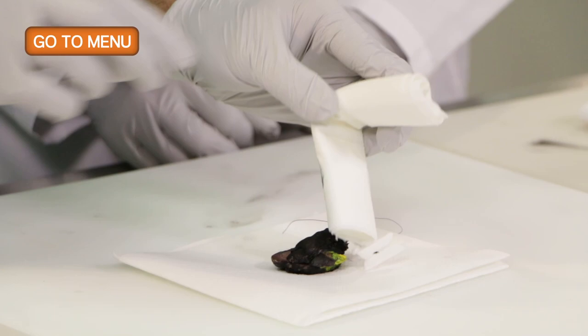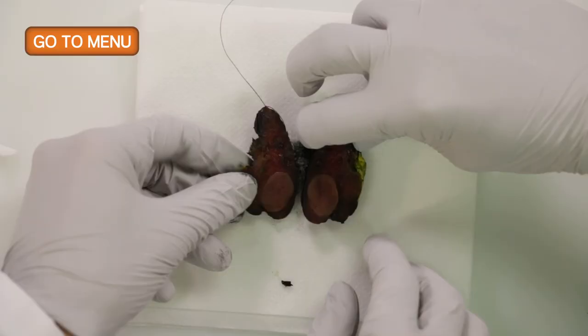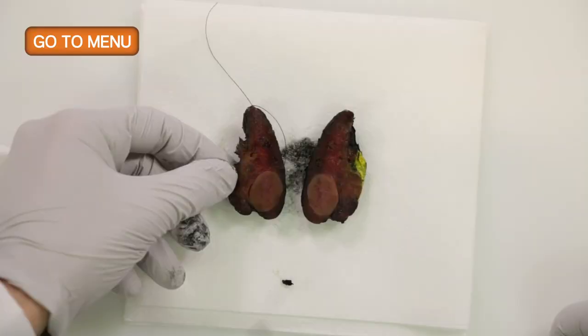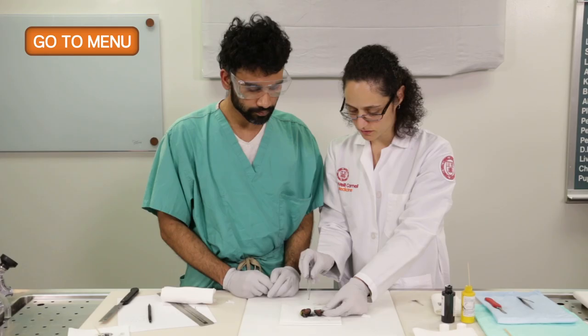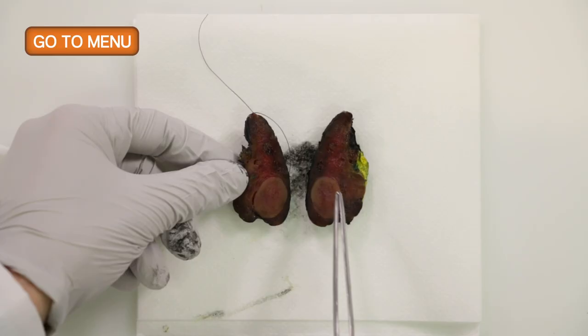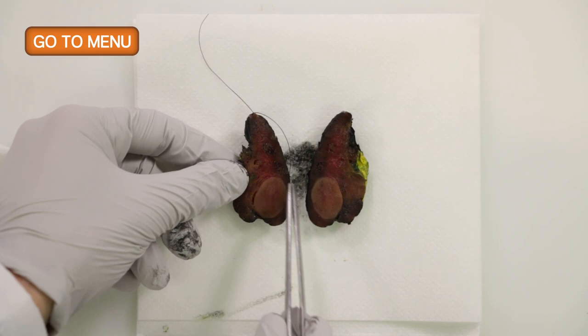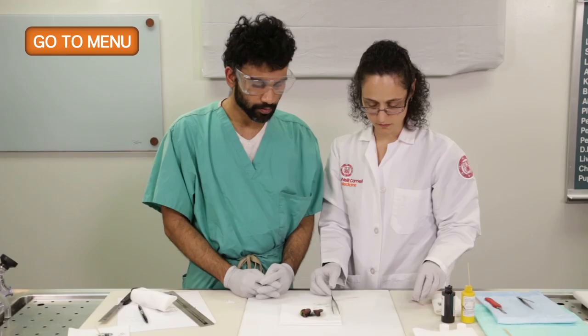So now that we've cut the specimen, we can visualize the nodule. You can see here's the normal background thyroid. But you can see here, there's a single solitary nodule right here in the inferior lobe. Yeah, I see that. And if you look closely, it looks very well circumscribed, but not encapsulated.